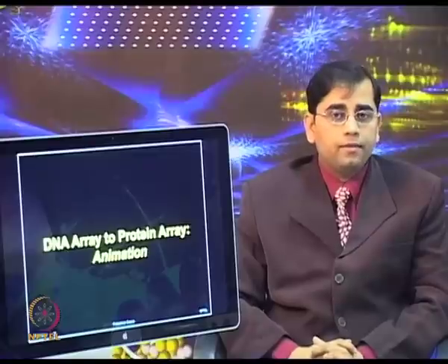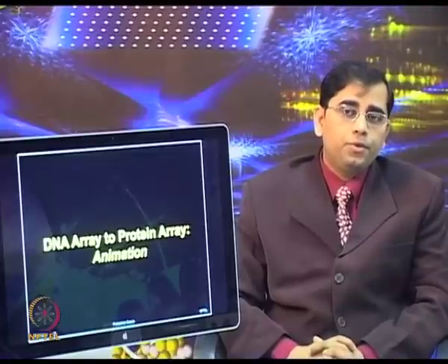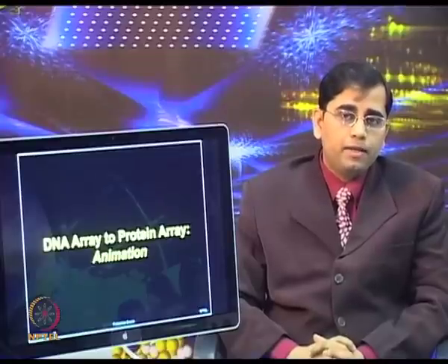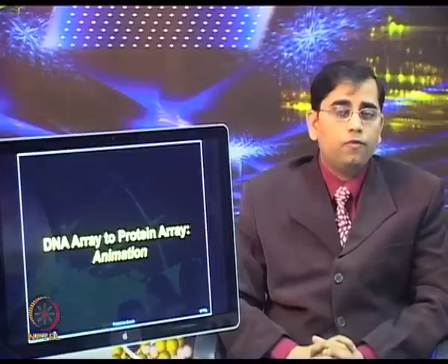So, in the DAPA approach, the investigators produced an array of double hexahistidine tagged GFP and the data was found to be comparable with existing protein array technologies.